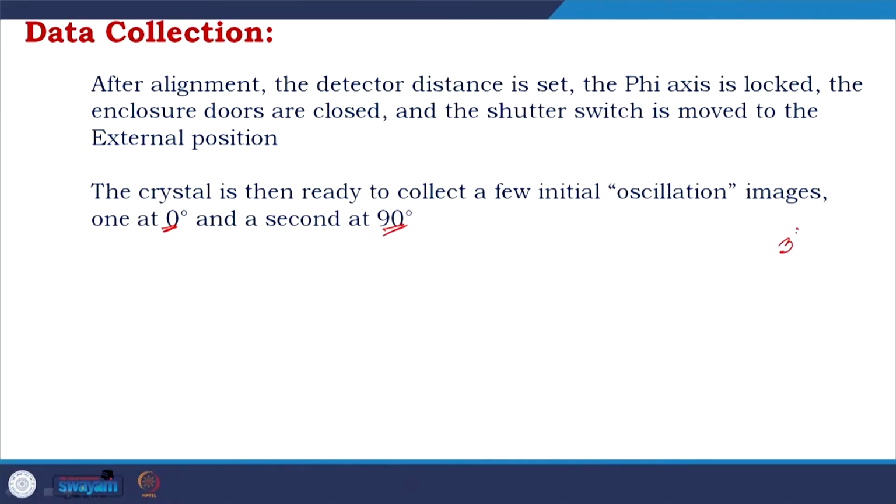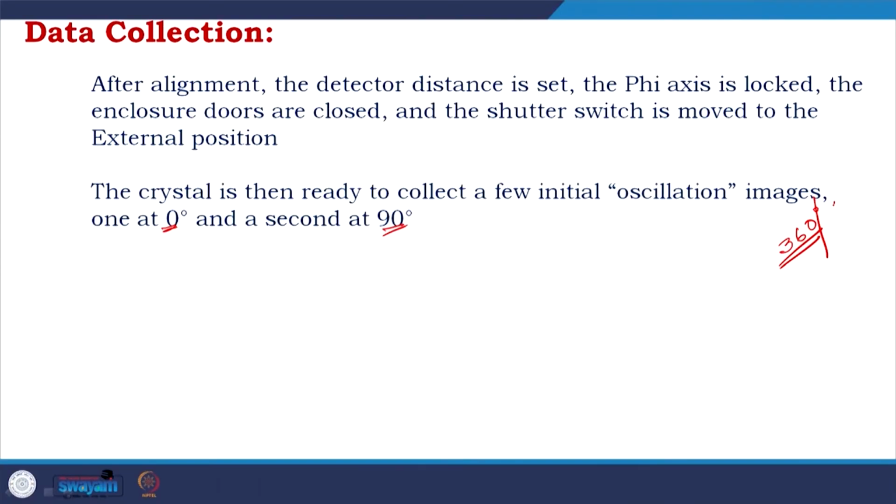Think about if you want to collect 360 degrees of images, so 360 images at one degree each. If you choose 1 minute, that is 6 hours.